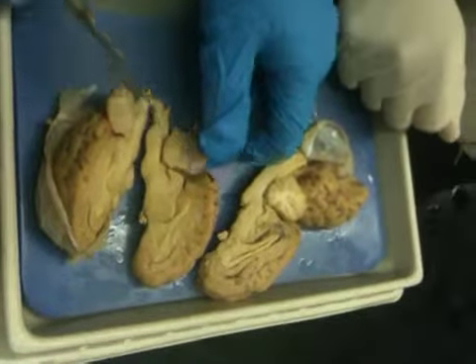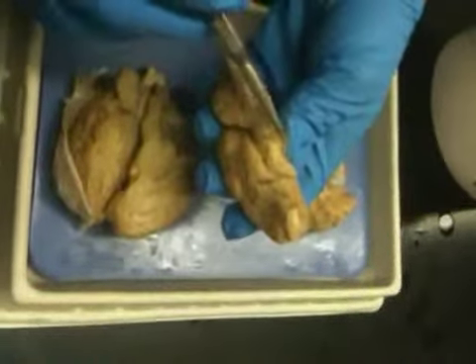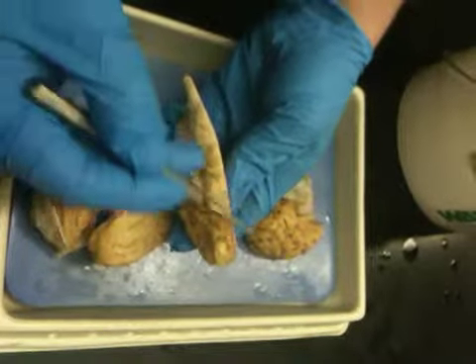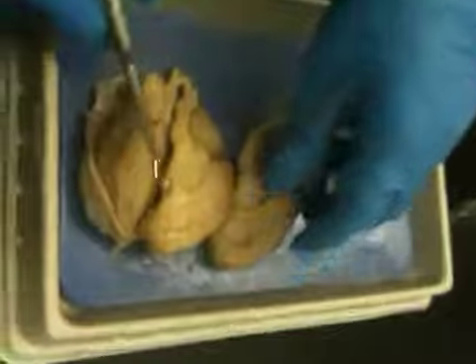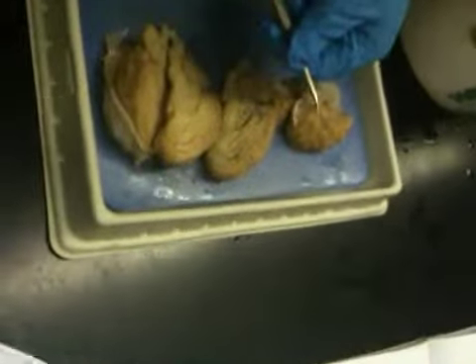The optic nerve would be, let me see which one of these. Okay, this one has an optic chiasm. The optic nerve would come out here and become the eye. There would be two of them. Okay. And then the trigeminal nerve. Let me see here. It should be here. Oh, there we go. Trigeminal nerve, number 30.